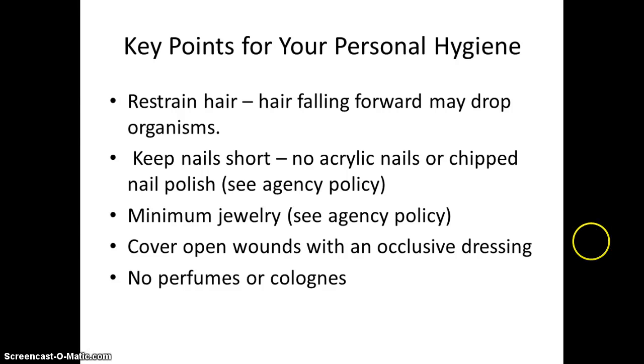Any open wounds that you have, scratches and that sort of thing, need to be covered with an occlusive dressing in a clinical setting. And certainly don't wear any perfumes or colognes. There are people that are highly allergic to that. So these are some key points that I wanted to let you know right up front that you need to follow when you're in a clinical setting.